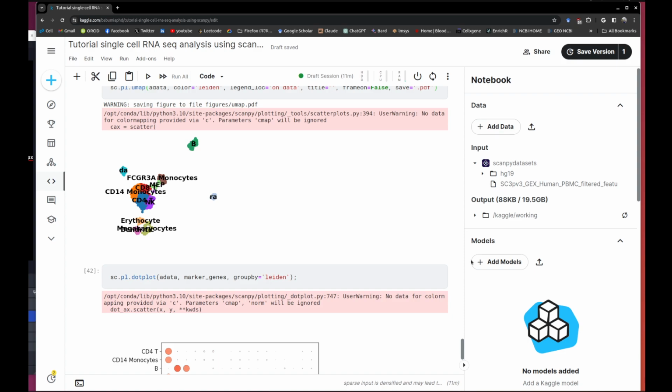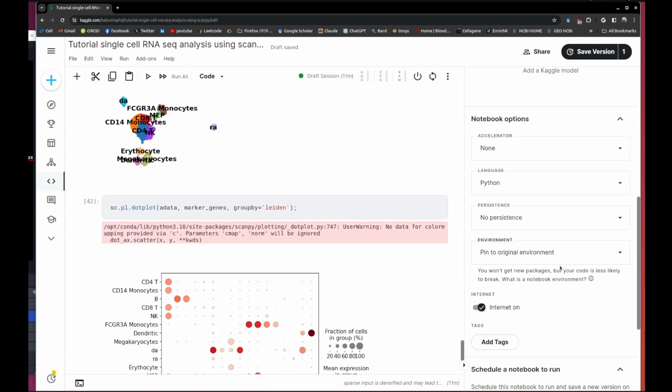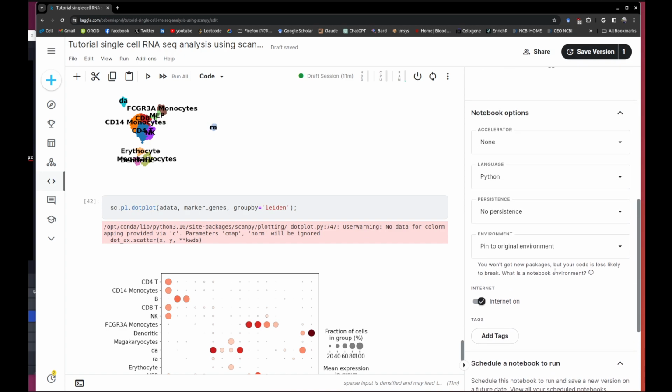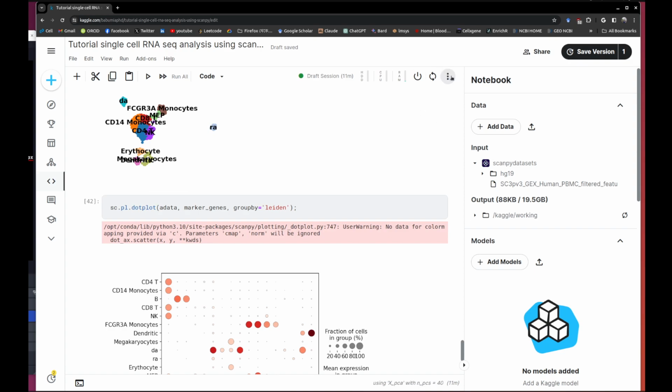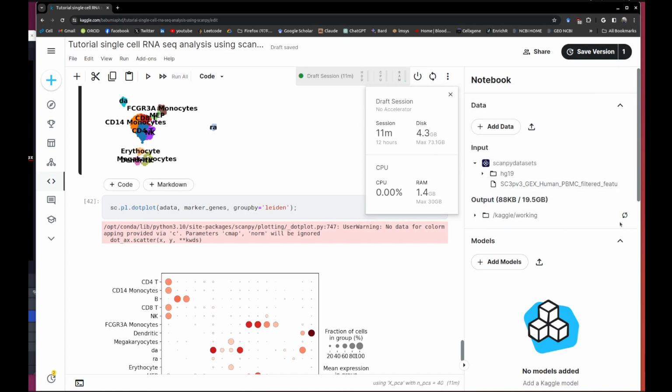You can always use this. Kaggle is a fantastic facility. If you want to use any accelerators in here, or I want to use the GPU or something like that, you can always select from here. As I have shown you earlier, there are lots of options that you can always do. You can do some adding, many things you can do. So I would leave it up to you, and this is the basic demonstration for someone who asked right now.